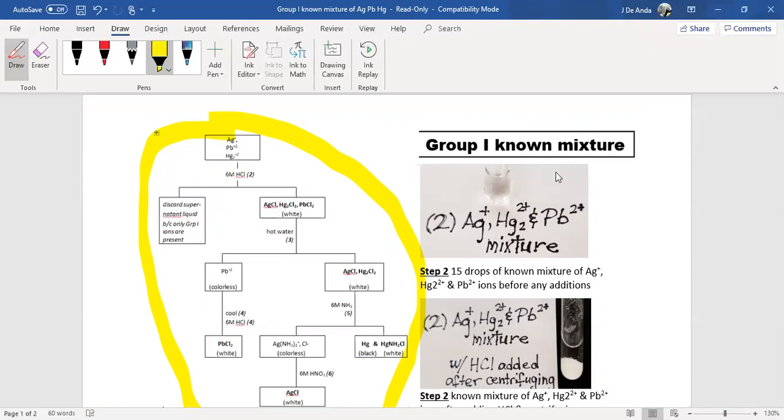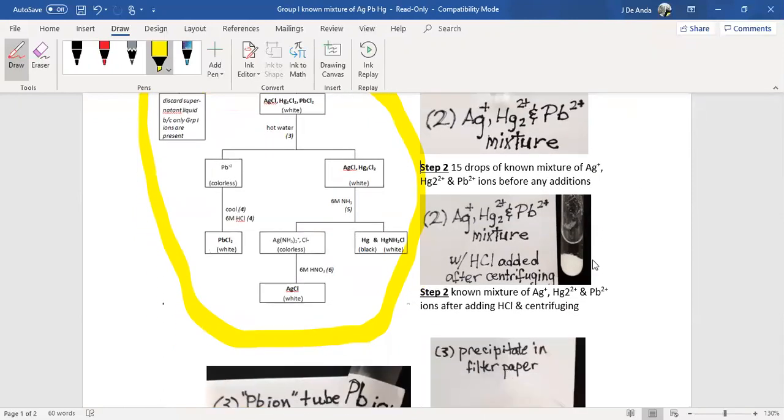You're going to start with a mixture, which is going to look simply like liquid, like it looks in here. And then after you've added your acid, you're going to see a precipitate form, which you will then spin to get it separated from the liquid. You'll decant the supernatant, give it an extra wash, and then have a clean pellet in there. Notice that in this flow chart, there are numbers that correspond to the steps outlined in your lab manual. In the same way, these pictures have the same numbers, so you can see what is happening at each one of those steps.